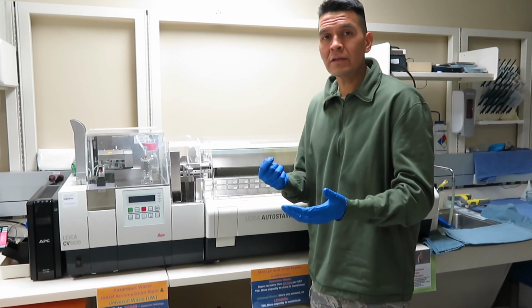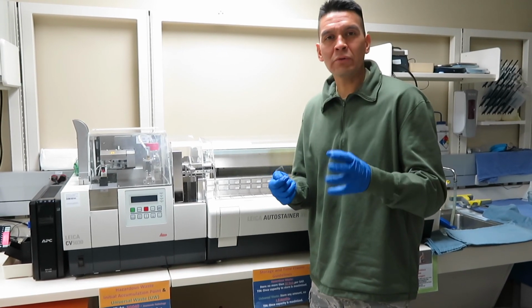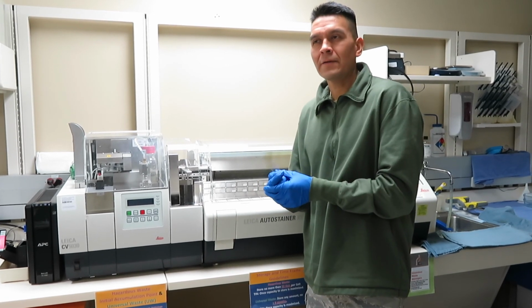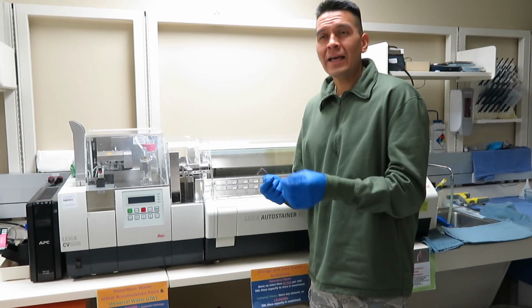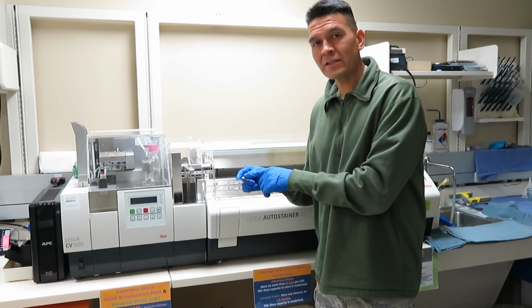And then the eosin is kind of a pink stain. The hematoxylin is like a bluish purple stain, and the eosin is more of a pink red stain. And that has a negative charge, the solution itself, and so that will adhere to the positively charged cytoplasm.